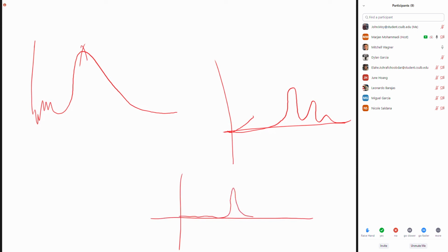So guys, if I want to include all this in one graph, that is actually nice. Usually I ask my students to do the same. Grab one set of data for any of these. Anthracene is nice, just for one PAH and for one ppm.